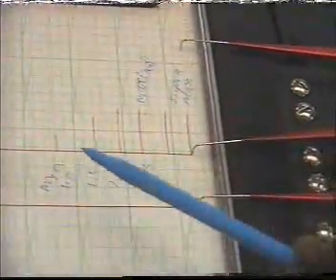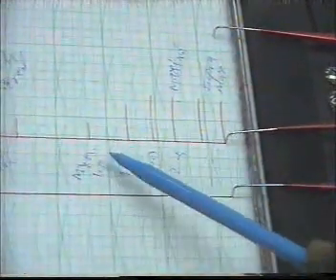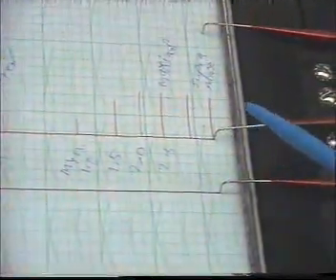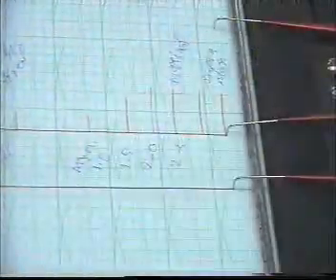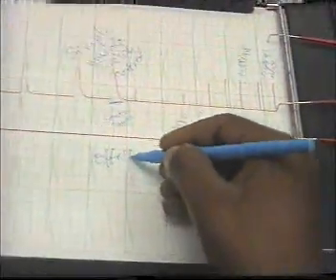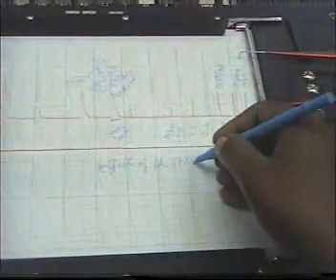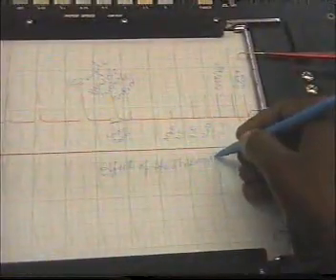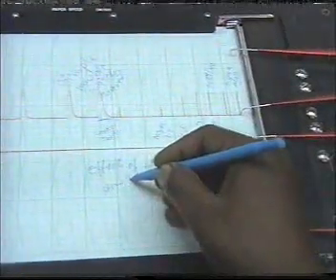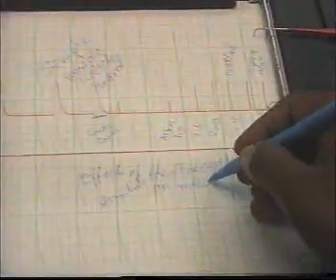هذه تجربة بسيطة توضح تأثير زيادة التنبيه على انقباض العضلة. The effect of increasing the strength of the stimulus on muscle contraction. Okay, and that effect of the strength of stimulus on muscle twitch, muscle contraction.